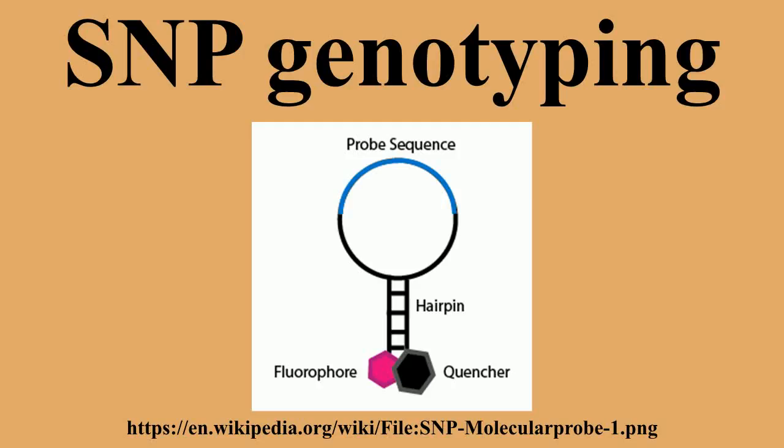Hybridization-based methods. Several applications have been developed that interrogate SNPs by hybridizing complementary DNA probes to the SNP site. The challenge of this approach is reducing cross-hybridization between the allele-specific probes. This challenge is generally overcome by manipulating the hybridization stringency conditions.